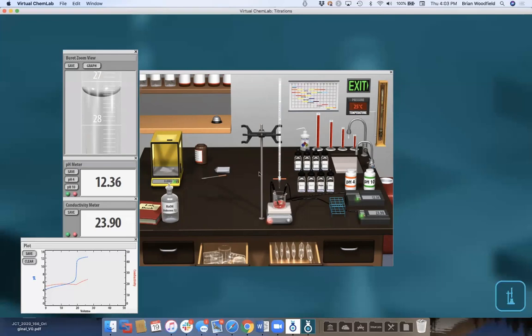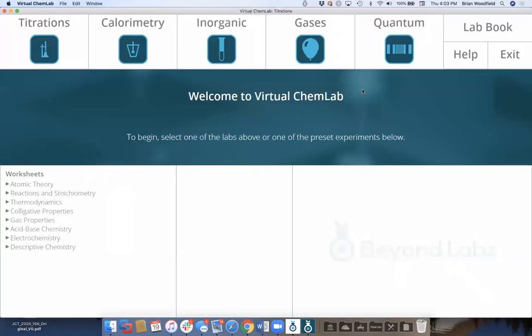Just to show you how detail oriented we are, there's a barometric pressure that changes every day in the room, because when you measure a mass on this balance, it's an observed mass and not a true mass. So the students are getting a little bit of air buoyancy. The glassware, like the pipettes and the burettes, have volumetric errors built into them, so they don't deliver perfectly. And there are also random errors thrown into reading the volumes and such. So that's a crash course through the general chemistry lab. They're super powerful, and students get to do lots of good learning with them.